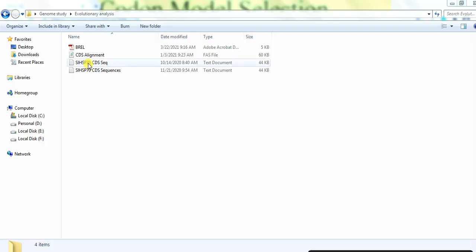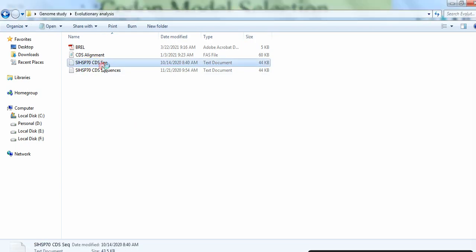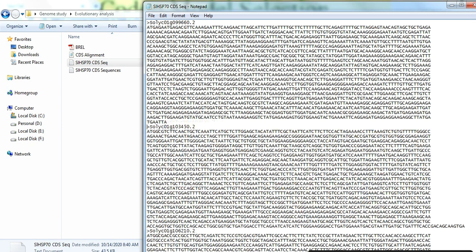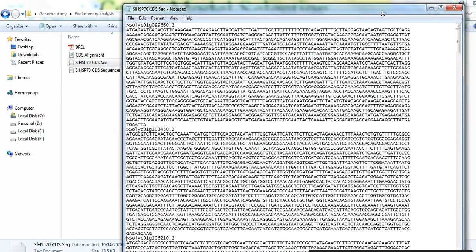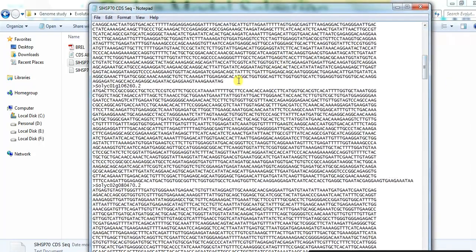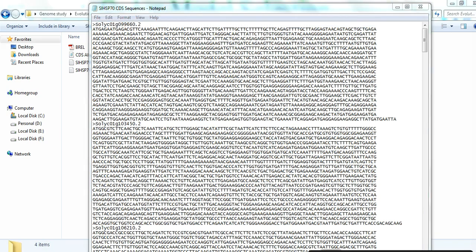To get this analysis, start by opening your files containing the CDS sequences. Then remove the stop codon of each gene. After removing the stop codon from each gene, press Ctrl+A to select all.